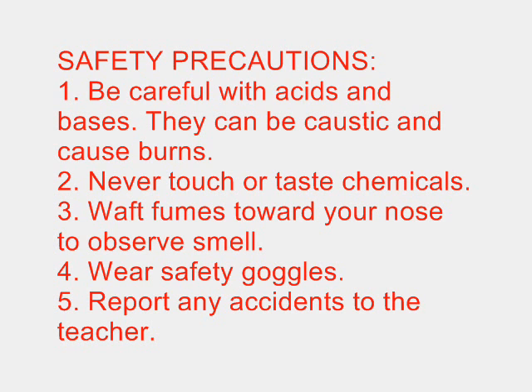The safety precautions that you need to take while performing this lab are: 1. Be careful with acids and bases. They can be caustic and cause burns. 2. Never touch or taste chemicals. 3. Waft fumes toward your nose to observe smell. Do not directly inhale fumes. 4. Wear safety goggles. 5. Report any accidents to the teacher.